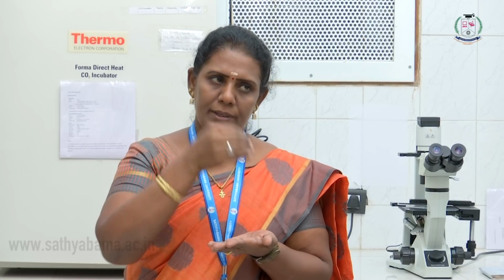How to perform it: on the first day we have to load the cells, seeding the cells into the 96 well plate. Then we wait for 1 full day to get a monolayer of the cells on the 96 well plate. On the second day we add different concentrations of our drug, for example 5 mg, 2.5 mg, and so on. Depending upon the concentration we prepare the triplicate wells, and we load the drugs onto the cells, and again we leave it for 1 more day.